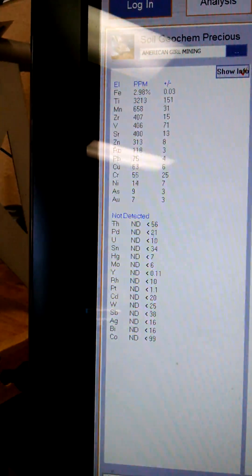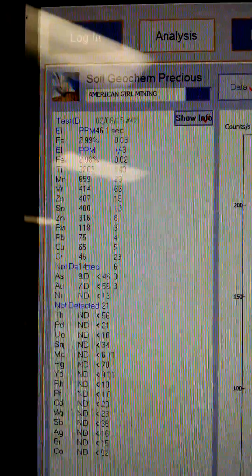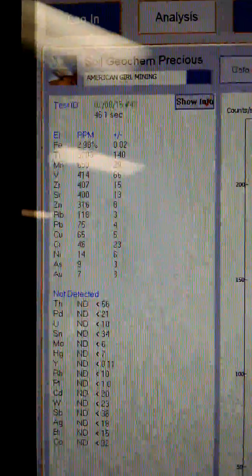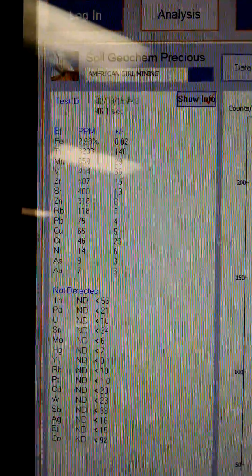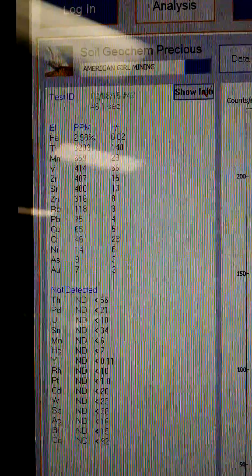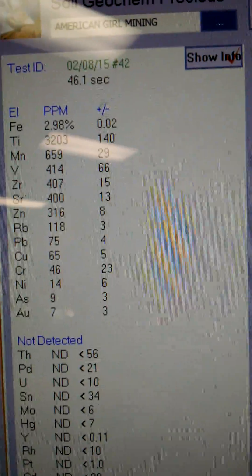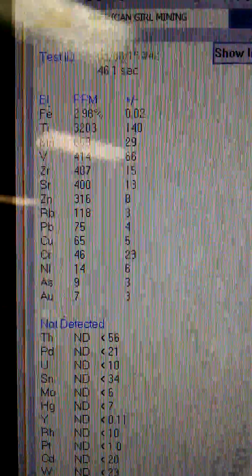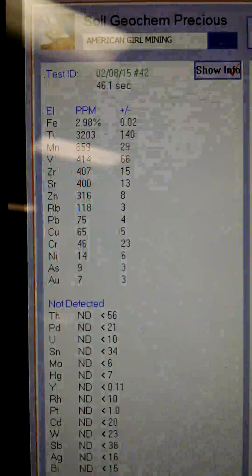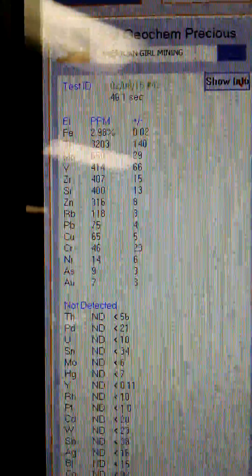Our gold did show up on it. If you look at the top, we have very little iron — that's FE — some titanium, and so on down: copper, chromium, nickel. And if you look right down at the bottom of that column — I'll put my finger right here by it — it says AU. That's gold. That's seven parts per million.